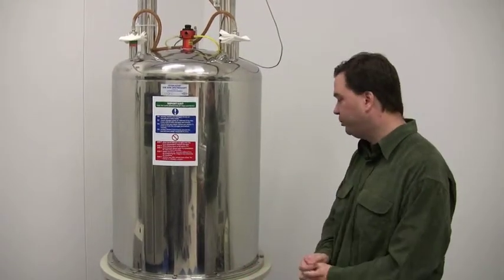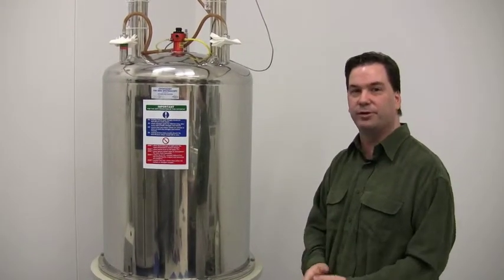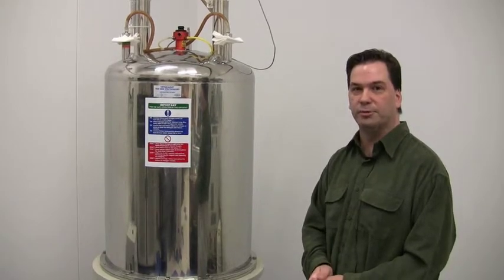Although it's optimized for proton sensitivity, it's also capable of acquiring phosphorus, carbon, and nitrogen-15 NMR as well.